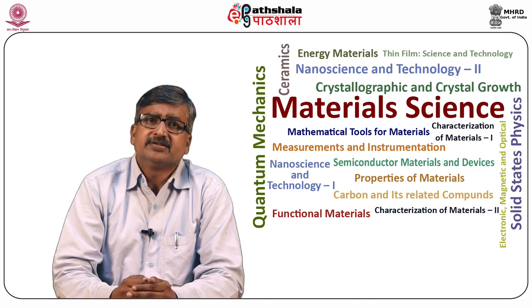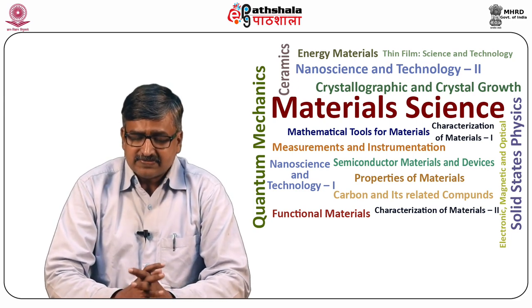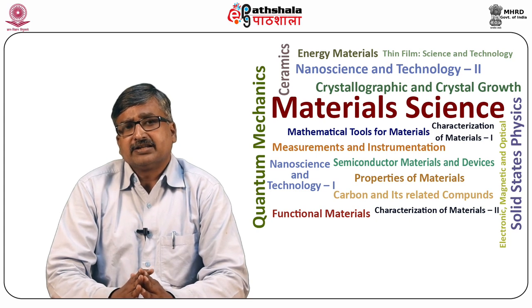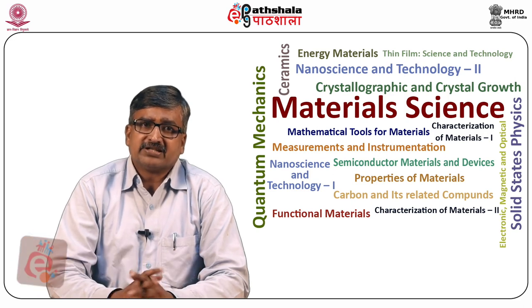The image is developed by interference of two waves, one of which undergoes a phase shift due to interaction with the sample crystal structure at a given thickness and is altered by the microscope aberration. So therefore, we are in a position to say that transmission electron microscopy is a very versatile tool to understand the structure of a material, and not only that, its composition, and spectroscopic techniques like EDX and EELS, which are the additional detectors used, can give us a very nice understanding of material at atomic scale. Thank you.